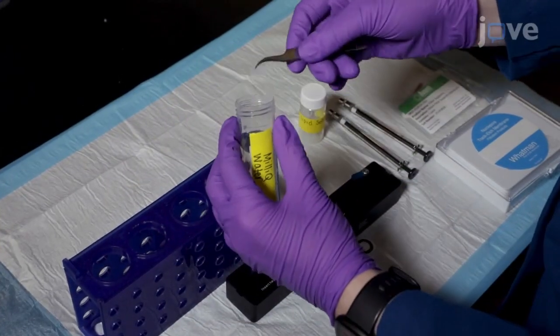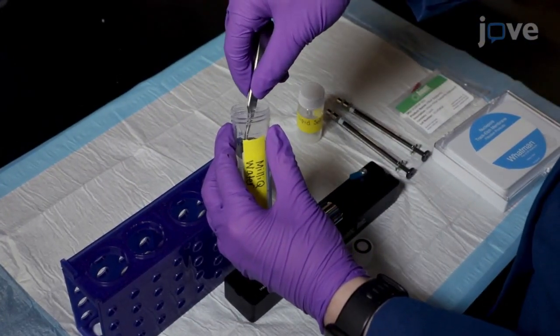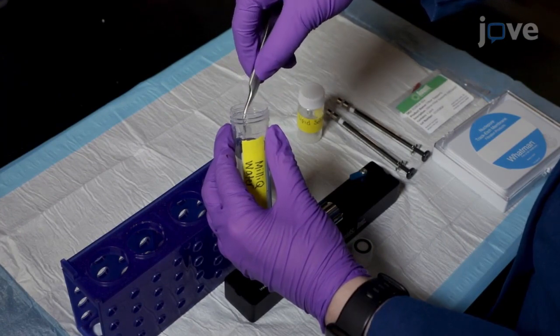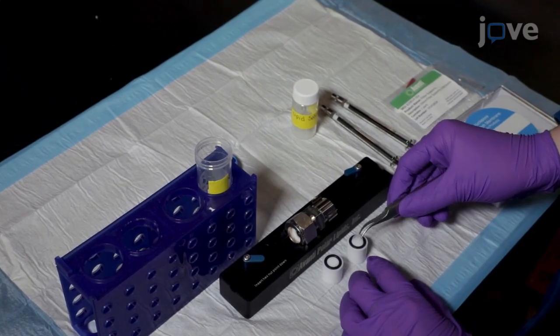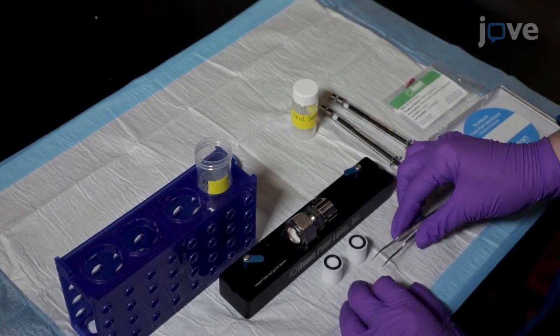To make one milliliter or less of vesicles, obtain a mini extruder. Pre-wet a filter support with ultra-pure water, then place it on the membrane support surface inside the O-ring. Repeat for the second internal membrane support.